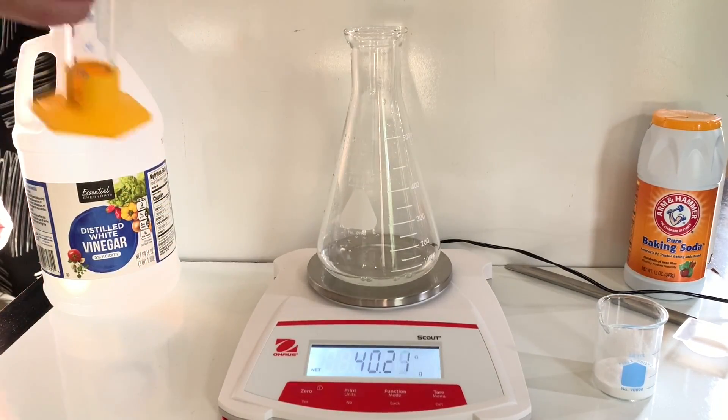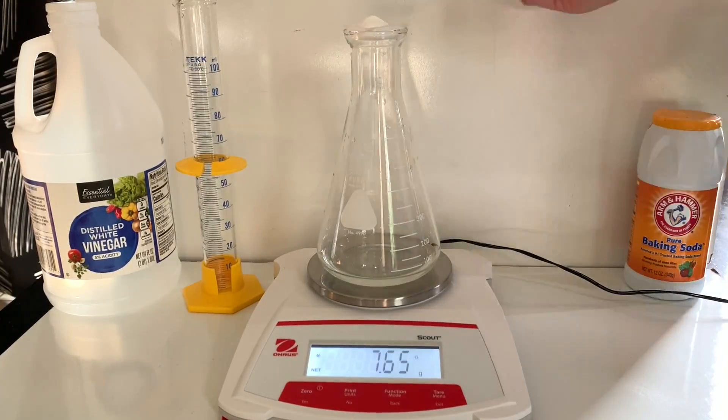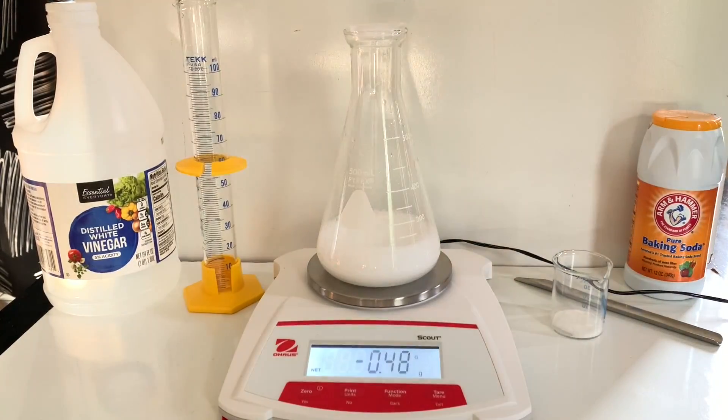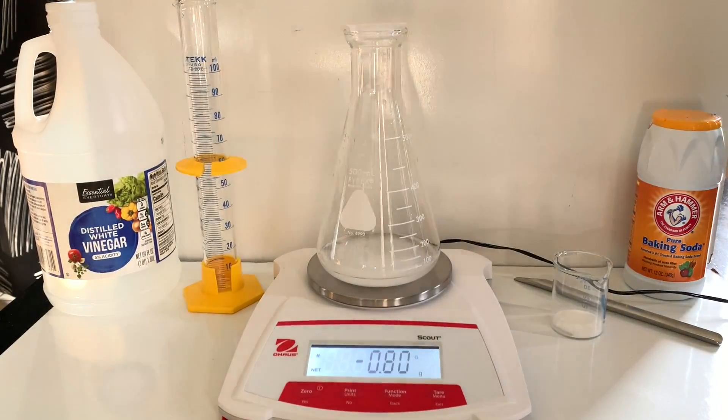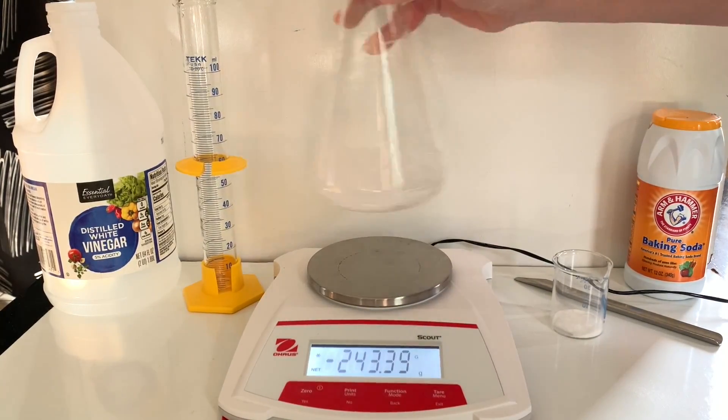I repeated the experiment but this time I placed all of my equipment and the reactants on the balance all at one time and then after I added my baking soda to the vinegar you can watch the mass decrease which is the approximate mass of carbon dioxide that's being released into the air in this experiment.